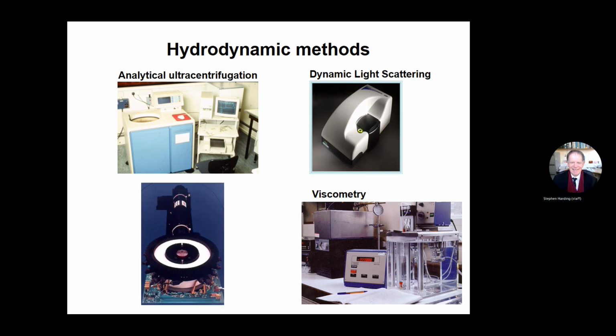Basically, as we'll see when we go across later for the demonstration, what happens is that solution comes from a chromatography column and is fed into this flow cell.